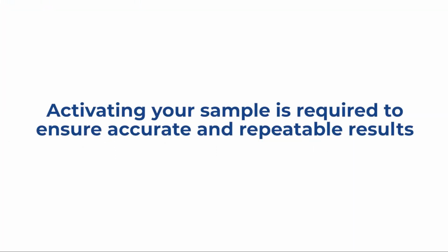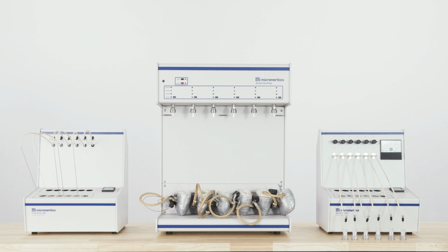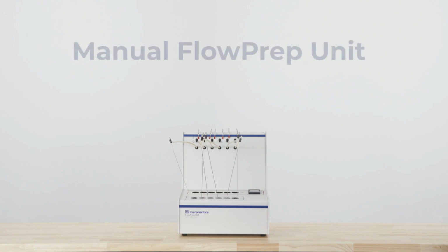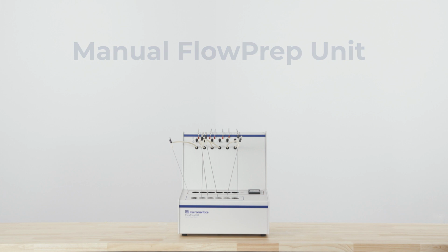When using the 3Flex, samples should first be activated prior to testing. At Micromeritics, we have a variety of different equipment for degassing your samples. One option is the Flow Prep, a simple and cost-effective sample preparation unit that continuously purges the sample at elevated temperature to remove weakly bound contaminants.